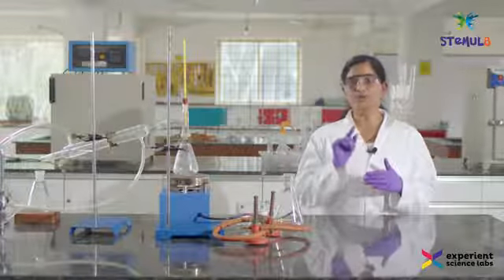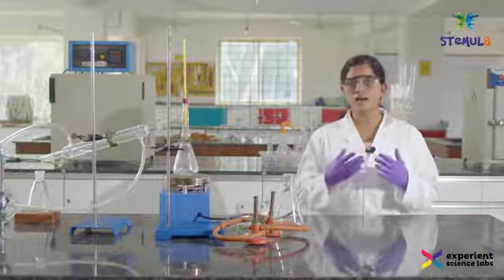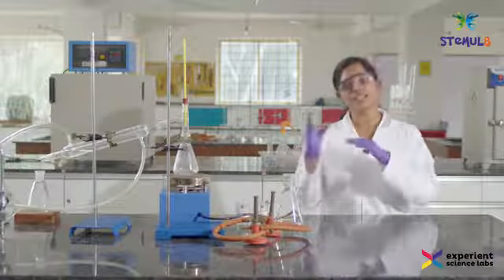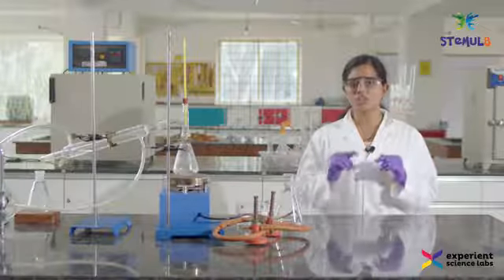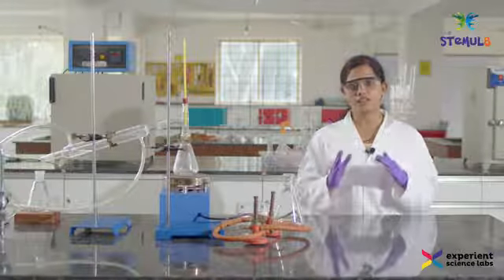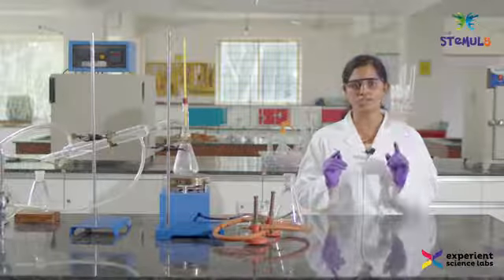If you don't have a 25 degree Celsius difference between them, it so happens that when you start heating the mixture, both the liquids start boiling and they condense at the same time, and you will again collect a mixture. Today, the homogeneous mixture that I am going to consider is a mixture of water and ethanol. So water and ethanol will be taken in a 1:1 ratio.